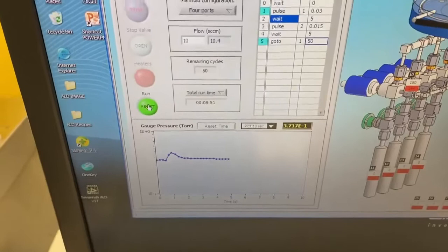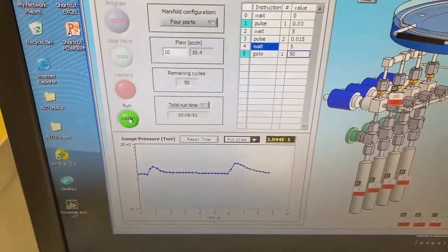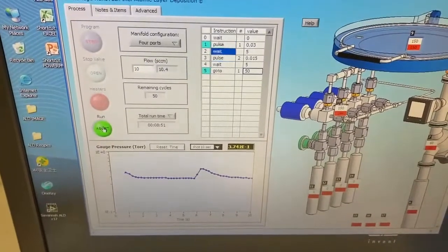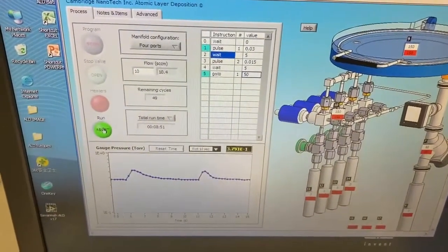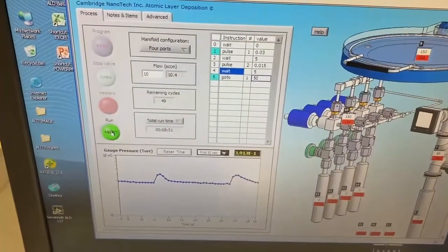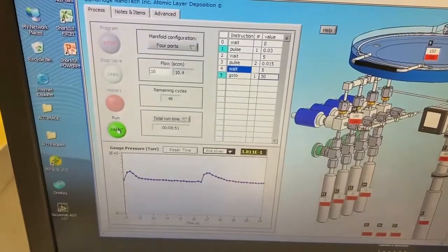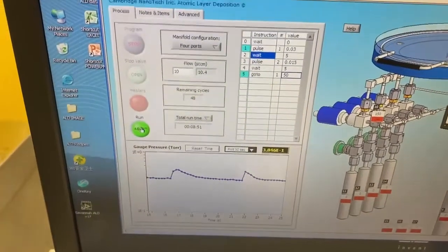During the run, you always need to confirm everything is going well. If the precursor is running out and the pulses disappear during the running cycles, you need to contact the group members in Dalton's group and do not attempt to change precursors by yourself.